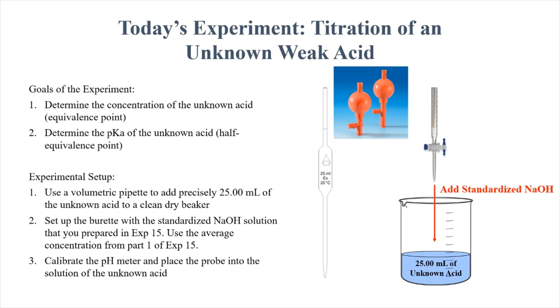And from those two data points, it sort of calibrates itself into the right pH range. And then it knows that this voltage is equivalent to this pH.